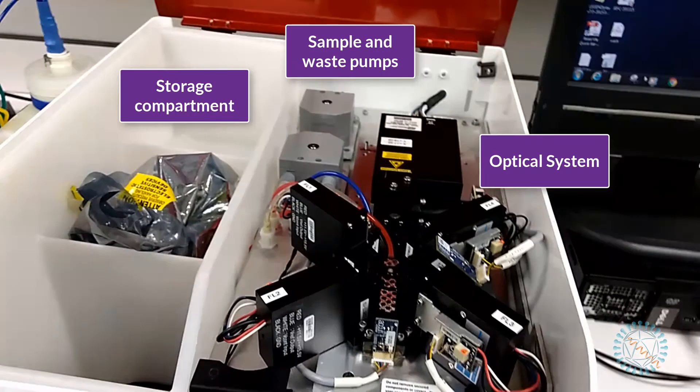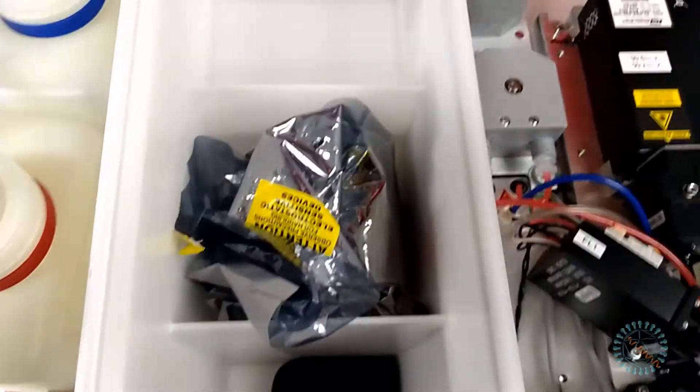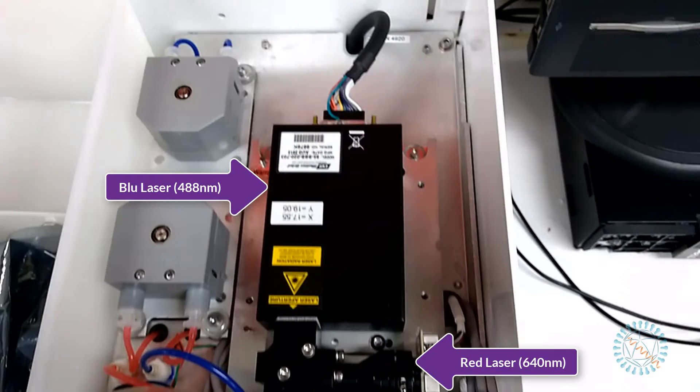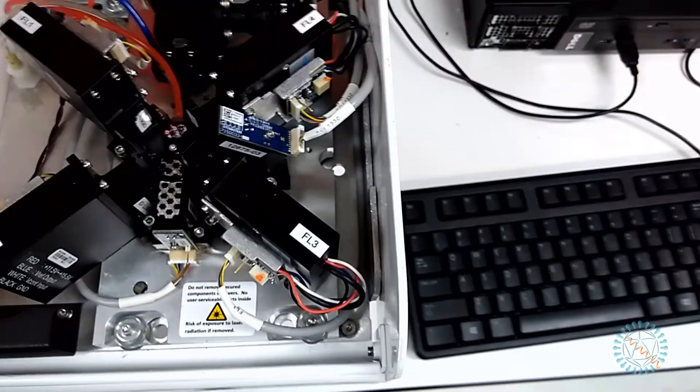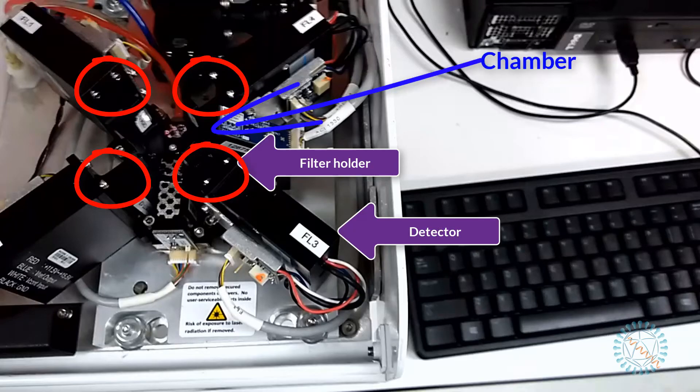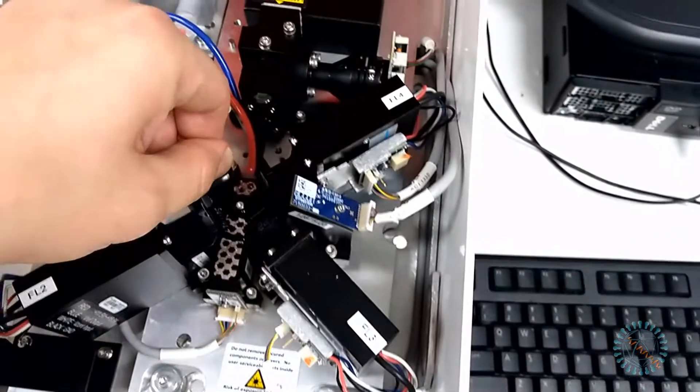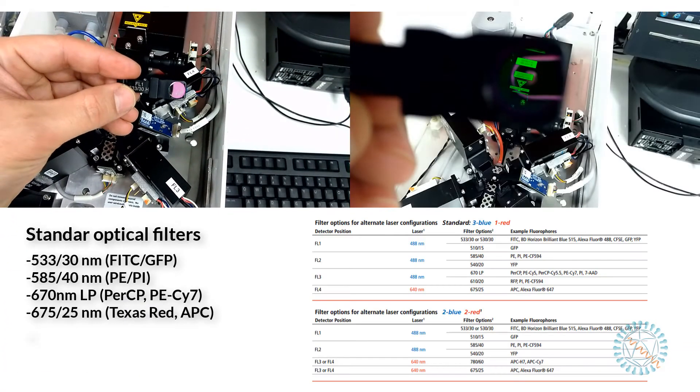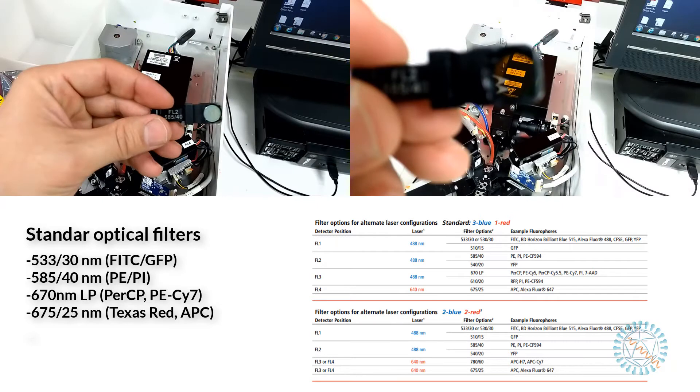By opening the top cover we can easily access a storage compartment, the rest of the fluidic system, and the optical system as well. The Accuri C6 is equipped with a 488nm blue laser and a 640nm red laser, both rated at approximately 20,000 hours of life. And also, as you can see, it can hold up to 4 different filters that are distributed around the measurement chamber. The optical filters are small and can easily be removed by hand without the use of tools. They come in a large variety of bandwidths and center wavelengths.